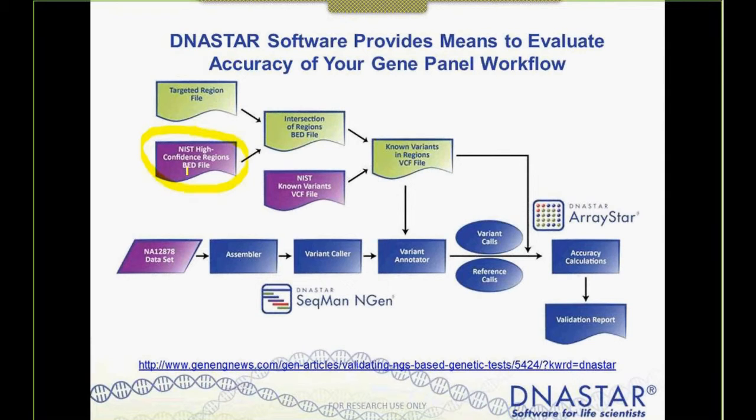There are some regions in the human genome where that's not the case. Some low information areas, for instance, where the alignments aren't as accurate. So this bed file then is, we'll call it 80% of the human genome, something like that. And then they also have a list of these several million variants that are called in that human genome.